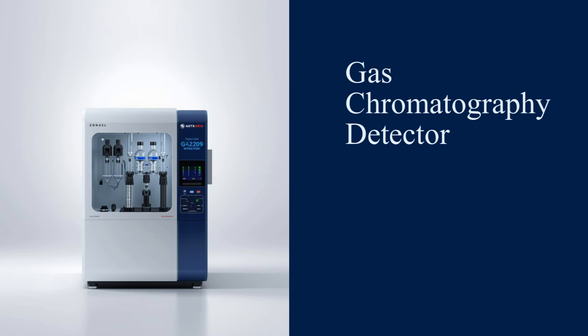Now, let's take a closer look at the detector in gas chromatography. The detector is a crucial component because it's responsible for identifying and quantifying the substances as they exit the column. Essentially, once the sample components are separated, the detector tells us what they are and how much of each is present. There are different types of detectors, each suited for specific applications, but their main job is to produce a measurable signal corresponding to the analytes. This signal is then recorded, allowing us to analyze the composition of our sample.